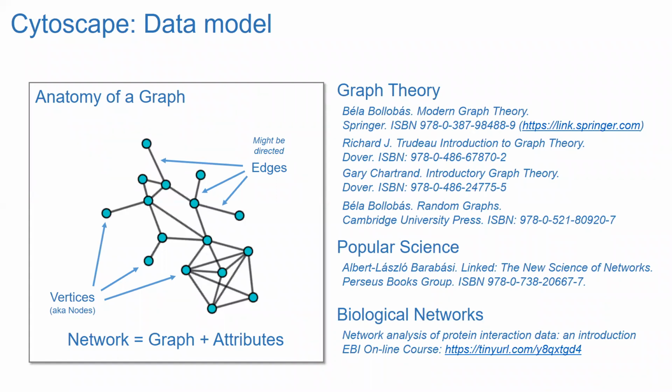There are tons of math behind it, and there are a couple of boring books that deal with the math behind it. And because there's a lot of math, there are parameters of the networks that are derived or introduced by mathematicians in more or less abstract way. Some of those things are commonly used, some of those things are less common, but they do exist. If something strange pops up, just use Google and try to find the math page about it.